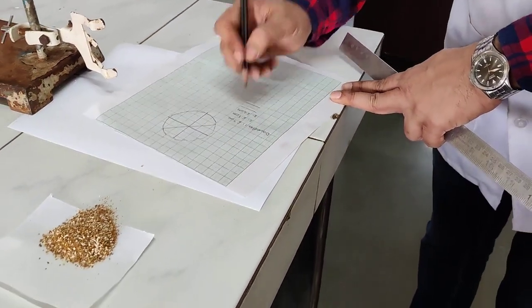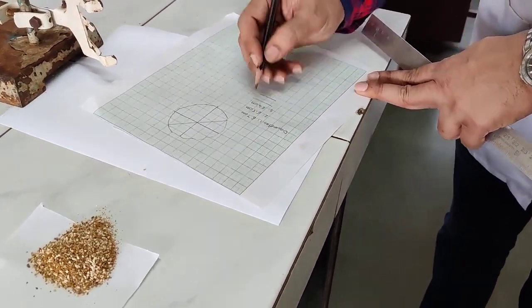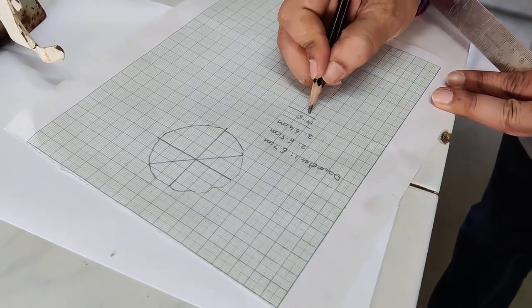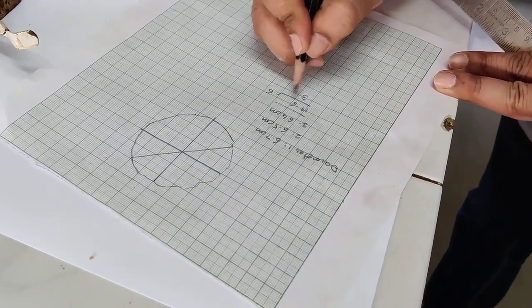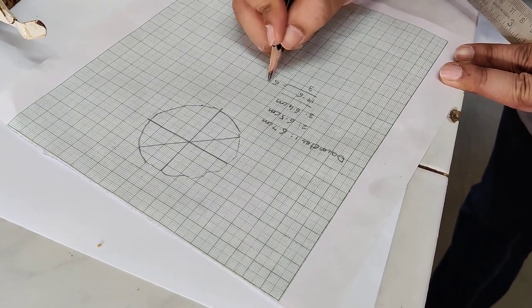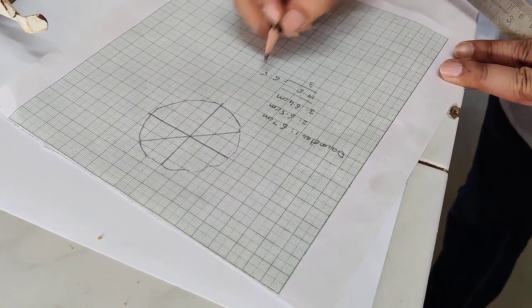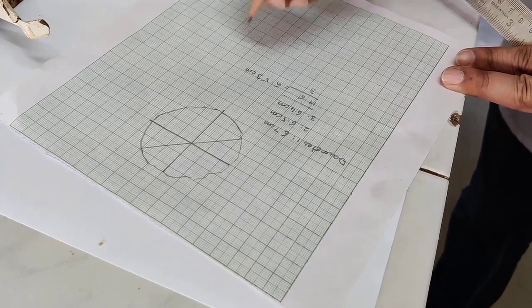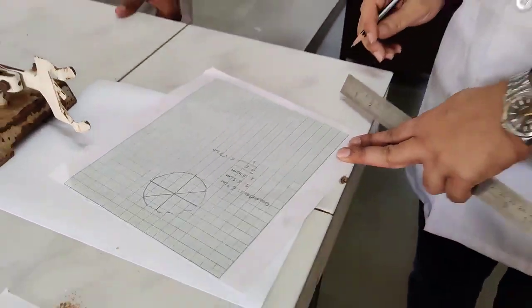So this comes to 7 plus 5 becomes 12, 12 plus 4 becomes 16, 6 plus 6.7 plus 6.5 plus 6.4 is 19.6. Divided by 3, it comes to approximately 6.53 centimeter.